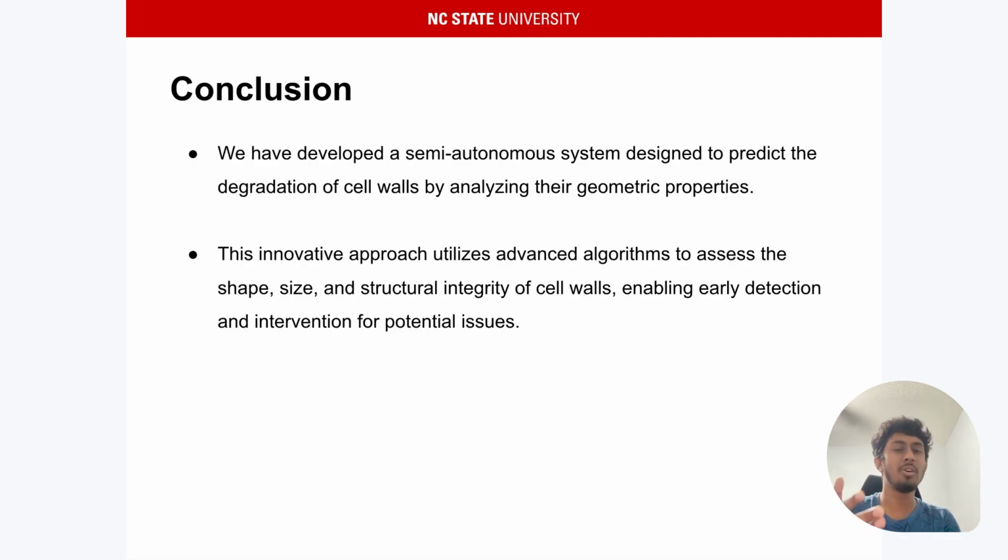And in conclusion, our work not only advances the understanding of plant cell morphology, but we can also clearly see that the advanced deep learning techniques applied over here really give better results in instance segmentation. As we had only 28 images, we can just propose this pipeline, and it was really hard for us to prevent the model from overfitting on the data. So in future, we are trying to extend the model by using more images, so that it might perform way better when compared to these models right now.